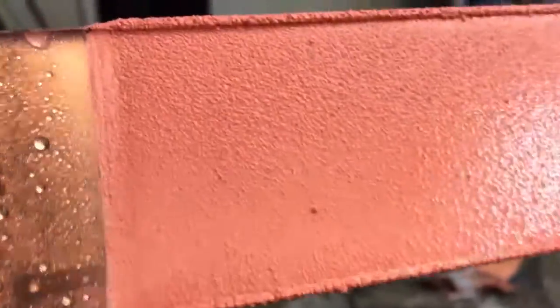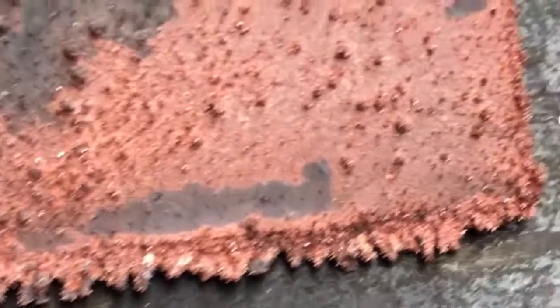Okay, so the lights are messing up on me, but here's the plate. It looks like it's in really good shape. You can see the stark difference as far as the crystal growth situation. I'm going to put these in some dilute hydrochloric acid, so we get a chance to look at them tomorrow also.